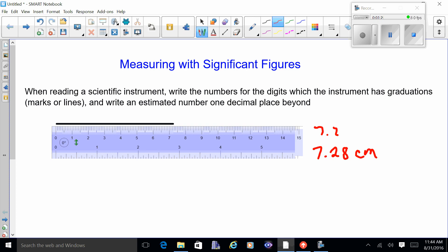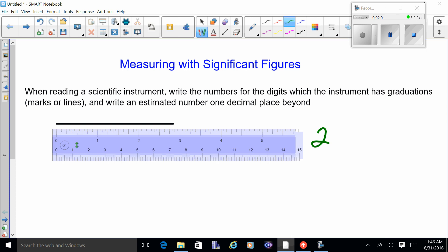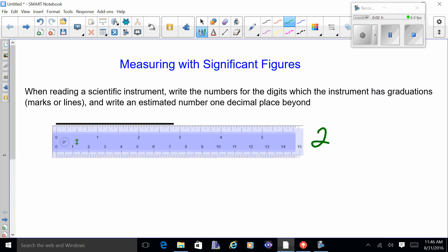Now I flip the ruler over to the English side, measuring inches. There are 16 lines from the two up to the three, so I'm going to use fractions rather than decimal places. This looks like at least two, and counting from eight sixteenths: nine, ten, eleven, twelve, thirteen, fourteen — so it looks about two and fourteen sixteenths. I'll put that in lowest terms: two and seven-eighths inches.